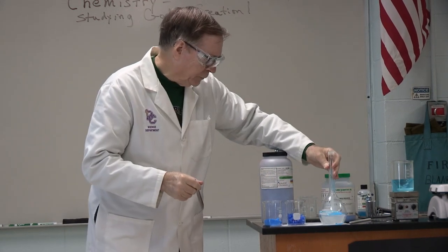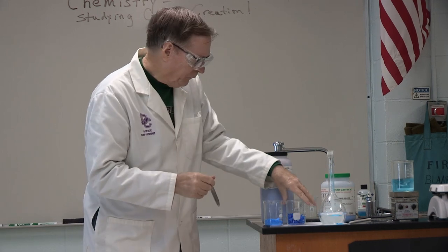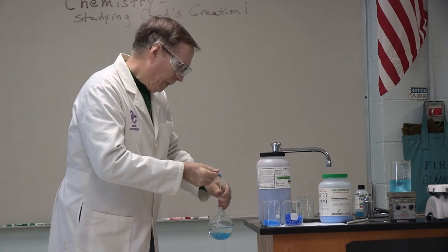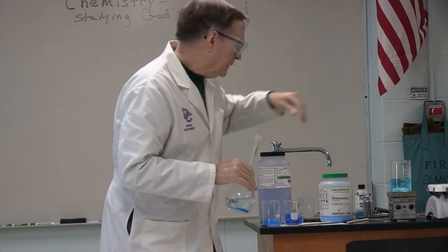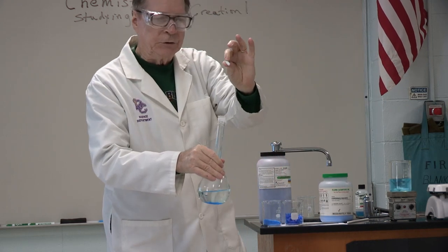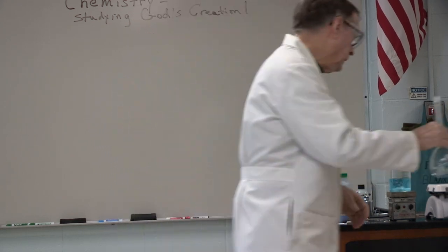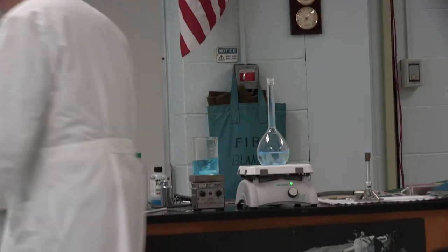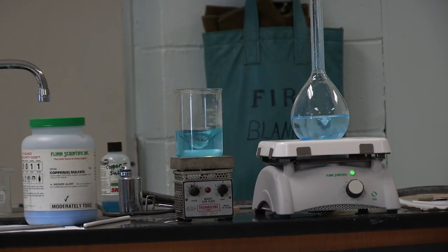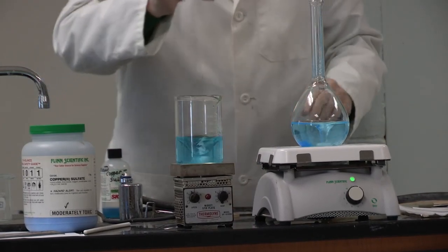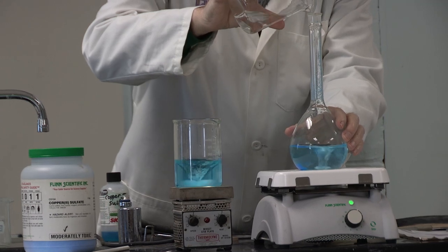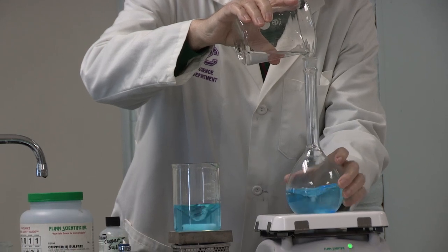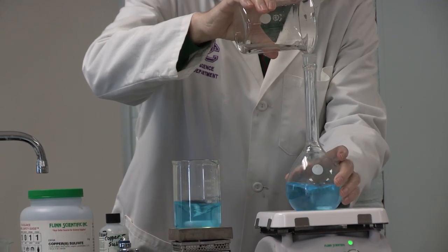For now we're just going to put in two scoops. I don't want to stand here stirring it for a long time, so I will put in a stir bar and put it on the stir plate and turn the stir plate on, and it begins to stir it for me. You might notice that I have some of the solution on the neck of the flask. You always want to rinse any solution down the neck that might be there, so that when you have your final dilution, you have all the salt in it that you want.